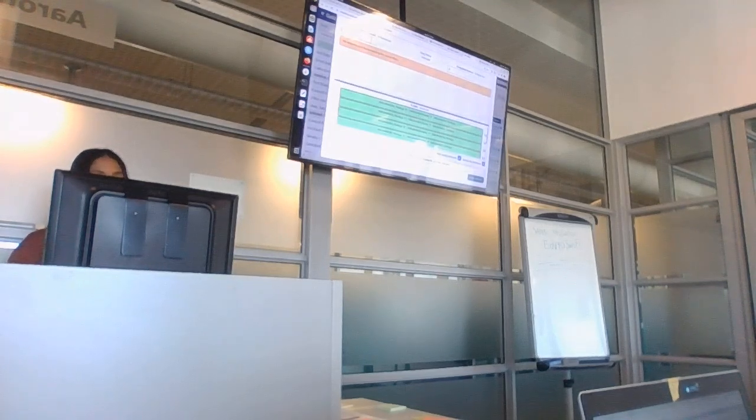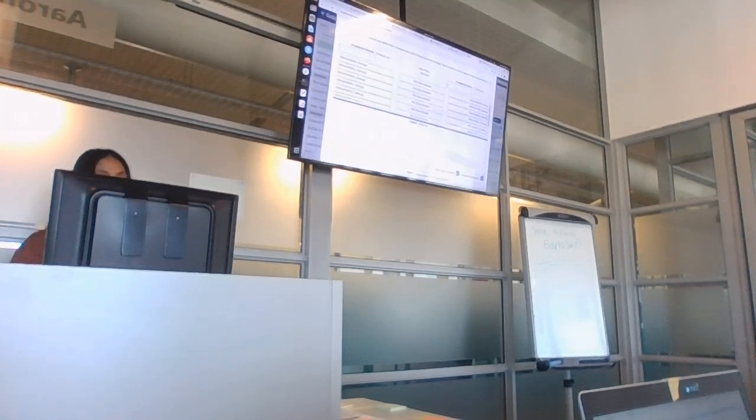The only reason it did this is because by default there's a _1 pattern here and a _2, and your files happen to have been named with _1 and _2. If that wasn't the case, click on this that says unpair all. Your files will actually appear here on top. And if you click on clear filters, you will see that it's not making any type of pairing over here. You would have to specify over here what it is.